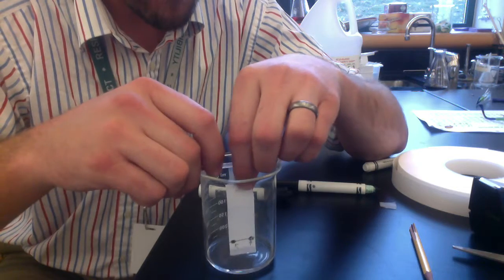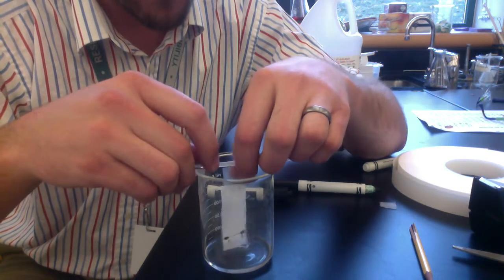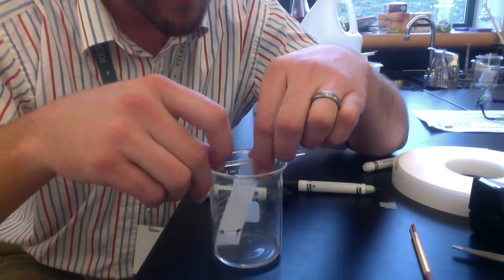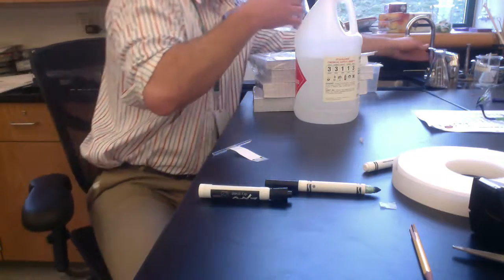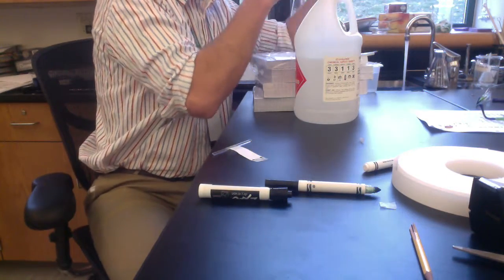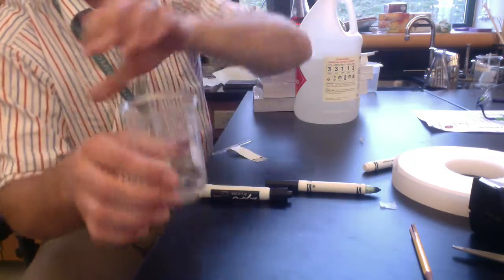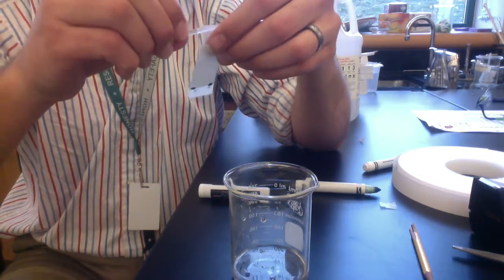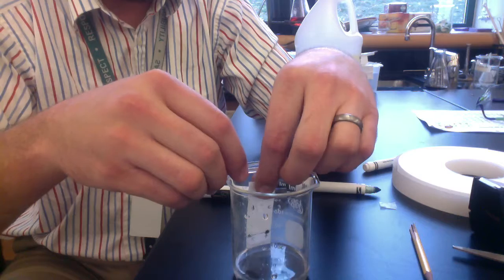And okay, there we go. This is far from perfect. I probably did not use a long enough piece of paper, or my beaker's too tall, one of the two. And gosh, I'm just going to add a titch more water. Okay, so this is really probably more water than I should be using, but that's how much I'm using to try and illustrate my point to you guys.